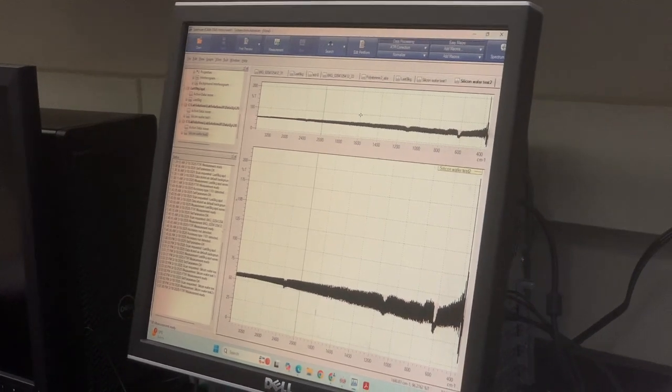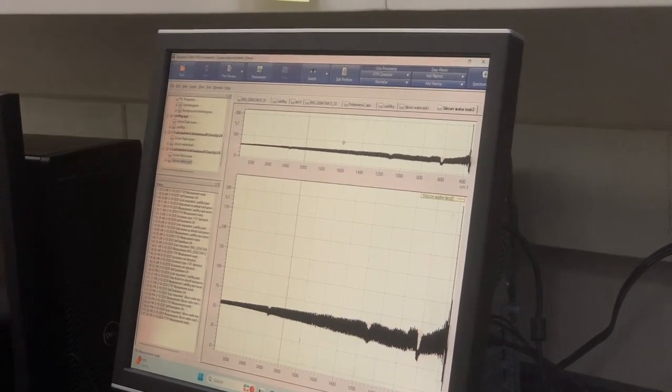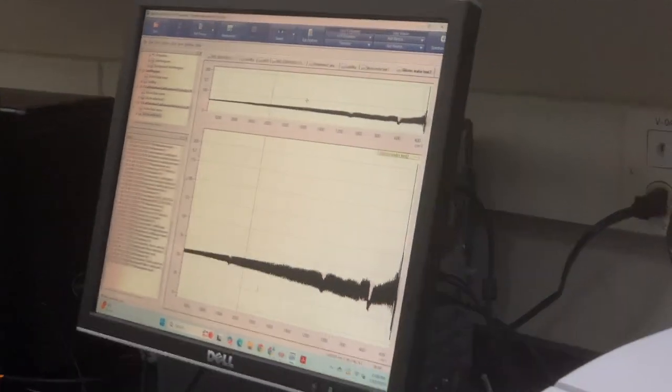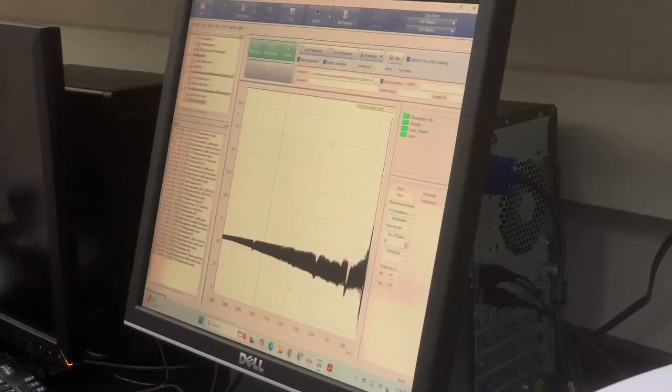You should be able to use the integrating sphere. It's very, very sensitive. Let's see. I know a customer that's doing inks with the integrating sphere, so I'm going to try to pull some application notes. Would you like me to try to connect you with that professor?